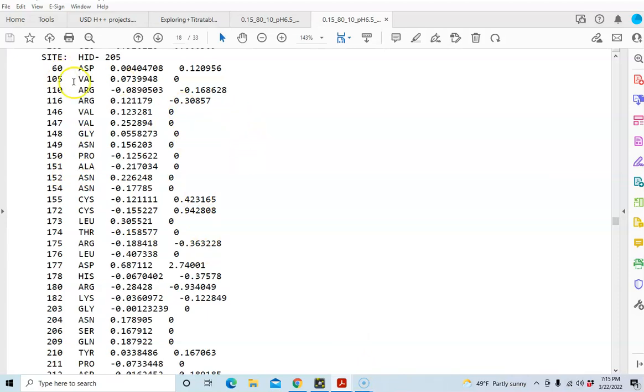And that makes sense because the histidine is an active site amino acid residue. Its ability to be protonated is very much contingent on its enzyme activity. So if you look at this, the first is the contributions to, how did I get to the 7.02 pKa? So these are all the contributions right here.